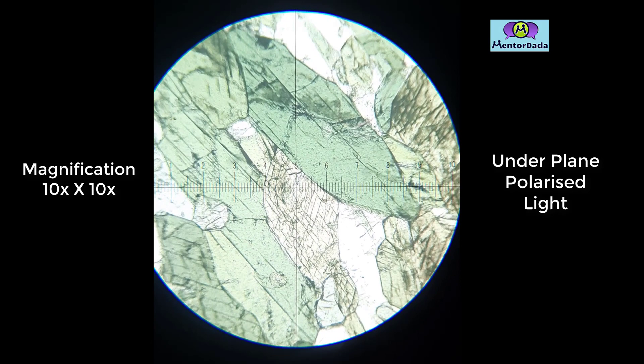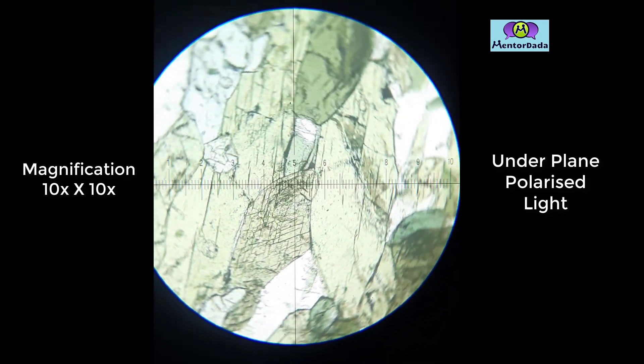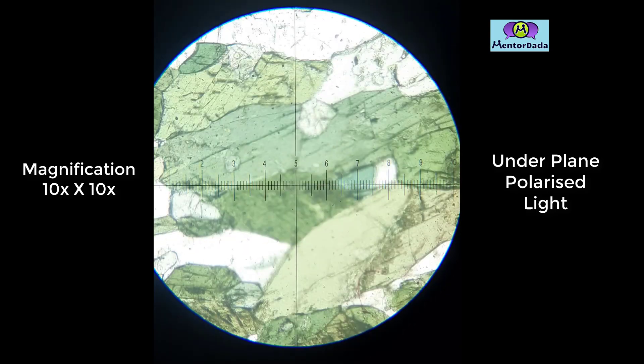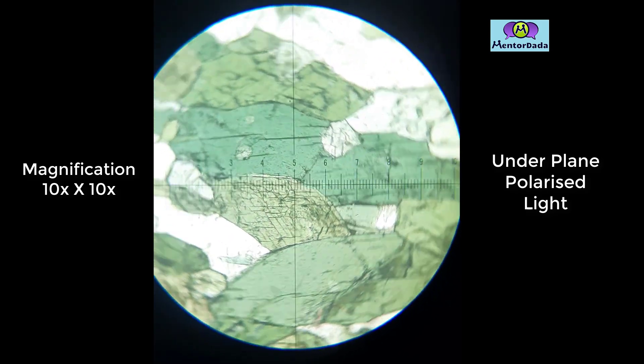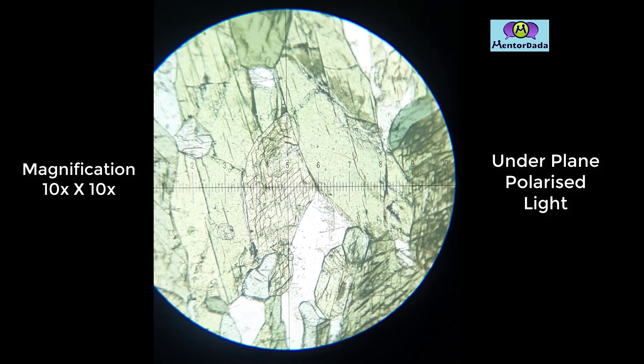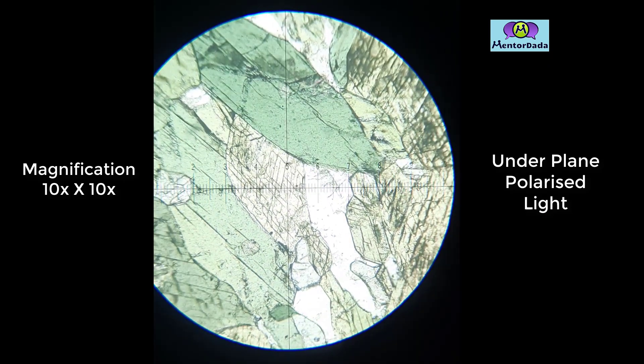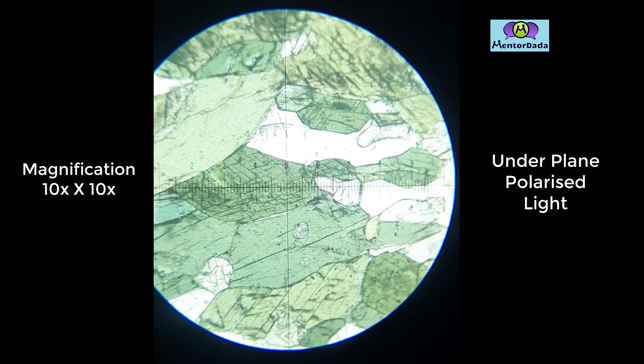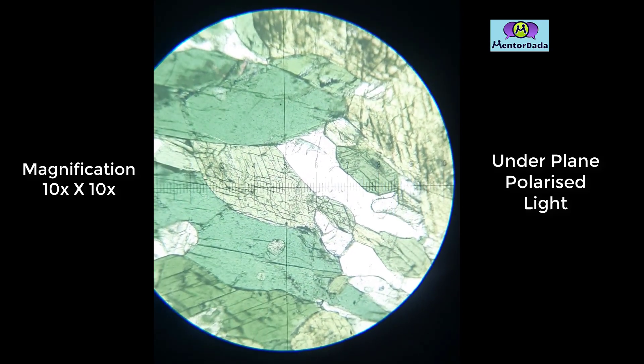The color is changing from almost light yellow to deep green. The mineral is showing two sets of cleavage, and these two sets of cleavage are at 124 degree and 56 degree angles, which suggests that this section is a basal section. Surface is moderately rough.